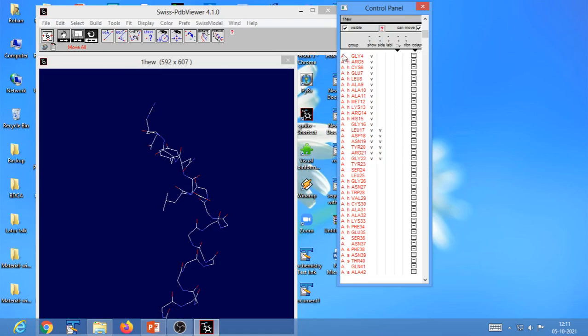This represents the chain of your protein. If there is a single chain in your protein, sometimes this column is left blank. Here we have A, which indicates that we are working on chain A of the given protein. If the model contains more than one chain, a one-letter chain designation would appear in this column. Since there is a single chain, there would be letter A right from the first amino acid residue till the end of your protein.